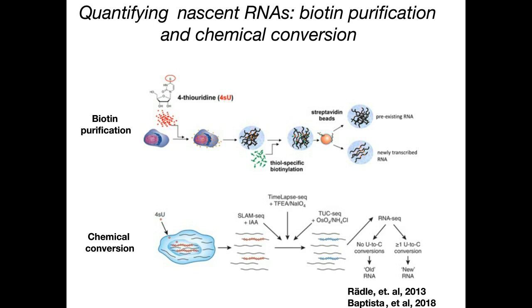And Lexogen actually provides a very nice solution for doing this, for doing SLAM-seq. At the beginning of my project, I used this product. It works quite easily in our hands. Also, you may notice quite a lot of high-profile papers which use this technology. But of course, this method is bulk-based RNA-seq. I believe they may also work on some single-cell versions, so stay tuned.